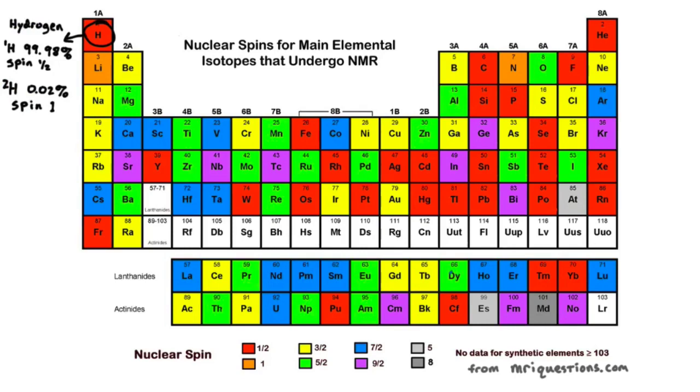And this is an amazing isotope for doing NMR. It's spin 1/2. It works really well for NMR. It's the basis of all kinds of stuff we do in chemistry. It's the basis of MRI. All MRI pretty much is looking at the hydrogen spin. We call it proton NMR or proton MRI because, well, hydrogen 1 really is just a proton.